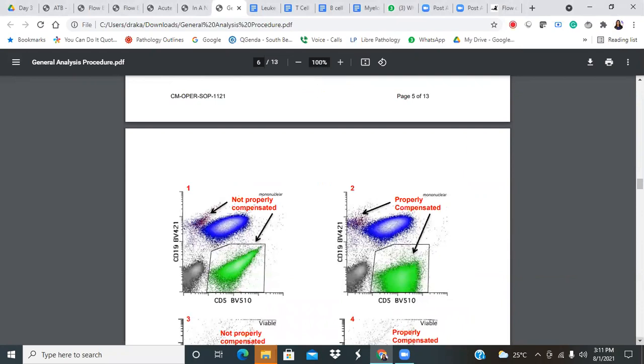Some of these cases, yes, I think most cases have two tubes, except maybe one. But if, ignore that, then just try to analyze whatever you see. You will see different color populations based on the tubes. That is correct. But each tube will have either CD19 or CD20 for you to identify the B cell population.